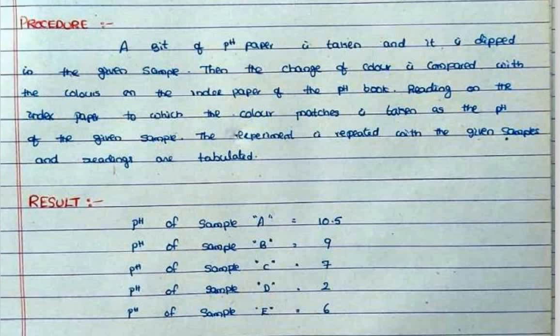The experiment is repeated with the given samples and readings are tabulated.